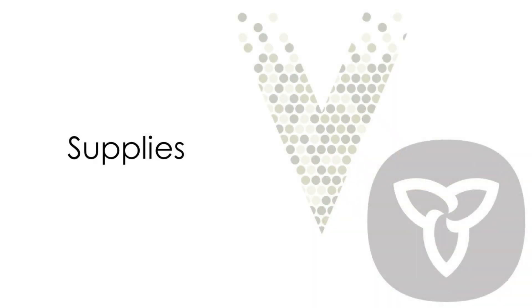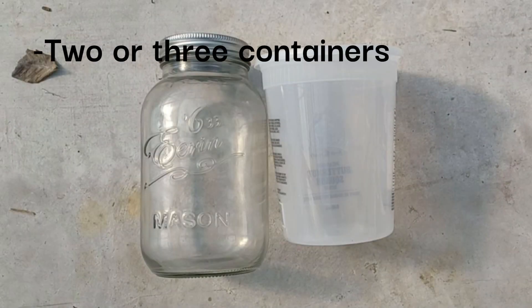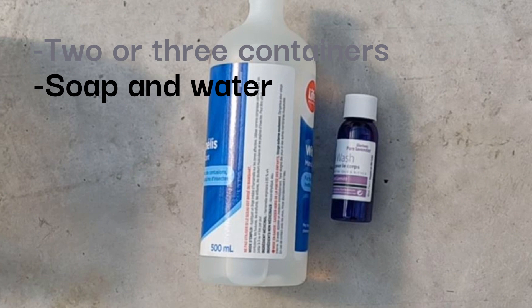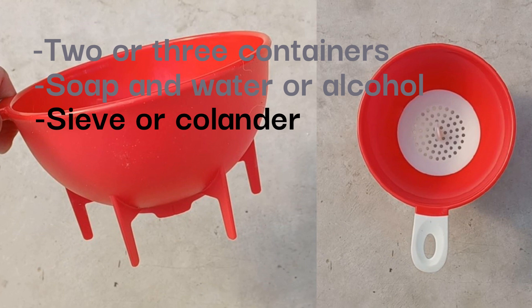The supplies you'll need to conduct plant washes on your farm are inexpensive and can be found on Amazon or from a drugstore or dollar store. You'll need two or three jars or containers like a deli food container or a mason jar with tight fitting lids.